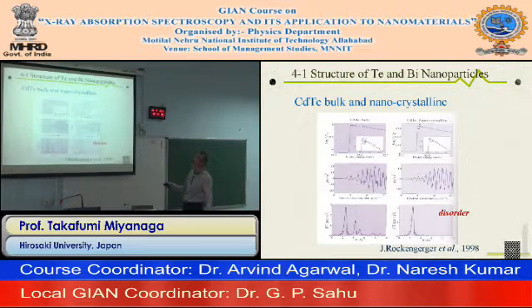Structure function in nanocrystallines. The final panel is the Fourier transform. The first nearest peak is here, and the second, third and further structures. We can observe the further structures. On the other hand, for nanocrystallines, only one strong nearest neighbor peak appears, and no other further contributions.